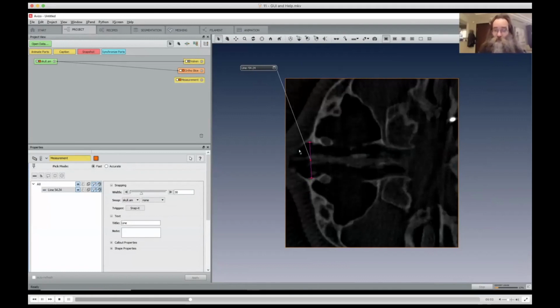But you can then move them later on, measure something different. And you can actually expand that and type in some notes or annotation, whatever you want. So you can also use this to annotate an image for a paper or a poster or something. It can be quite useful. If you want to get rid of it, just take the module that has been created and delete.